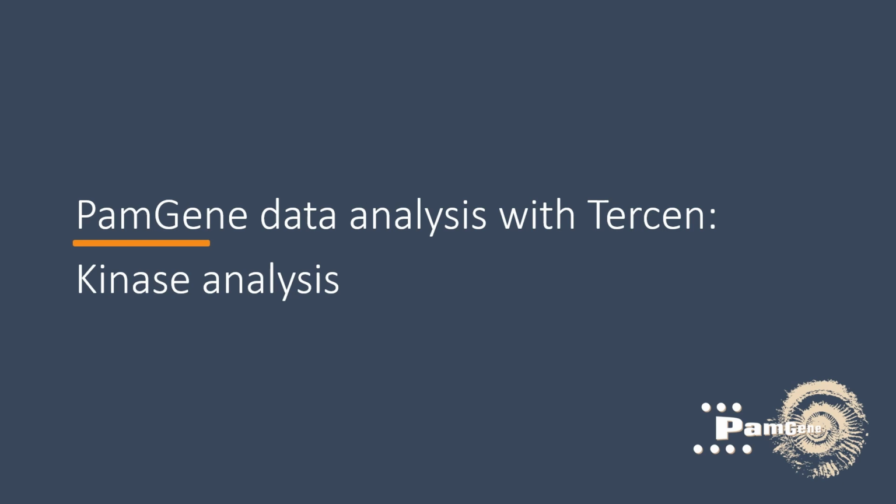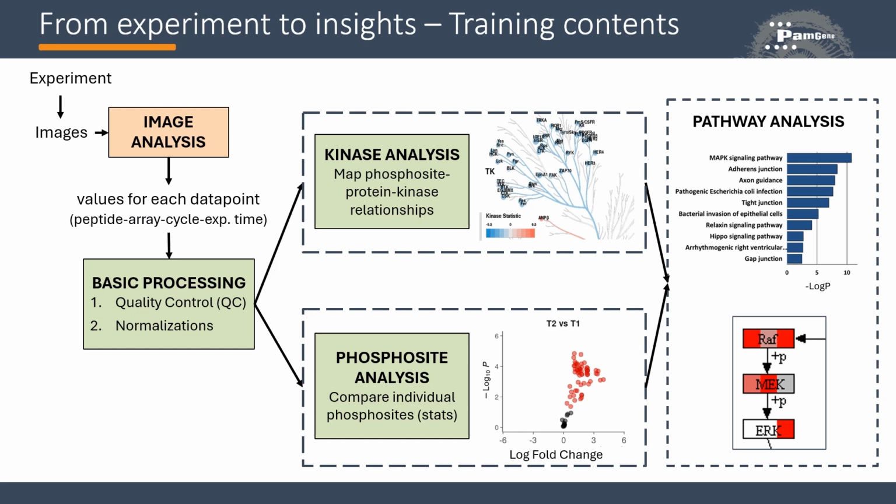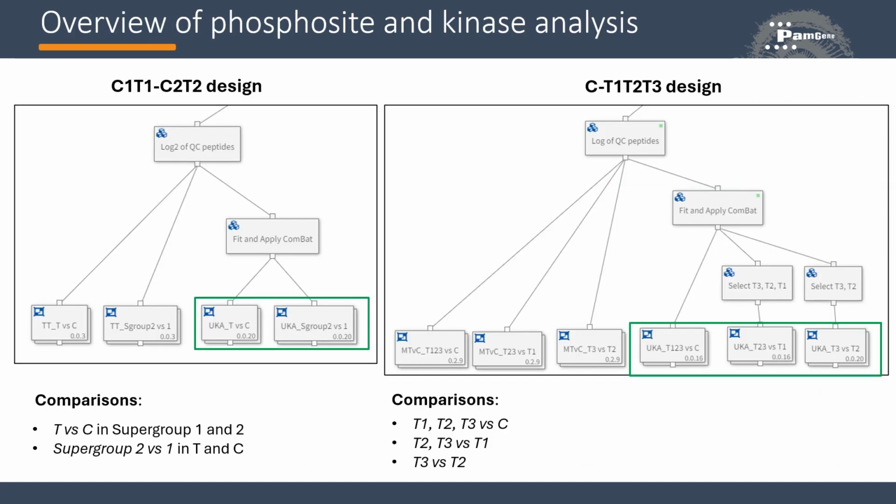Welcome to the fourth part of the PamGene data analysis training. In the previous videos, I talked about experiment design, image analysis, basic processing, and phosphosite analysis. In this video, I will talk about kinase analysis.